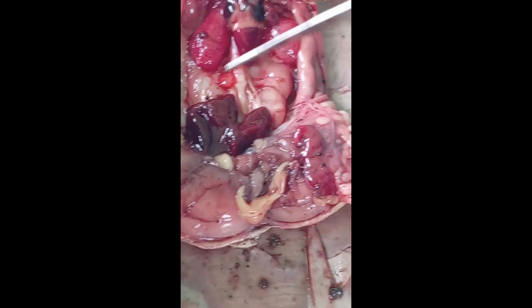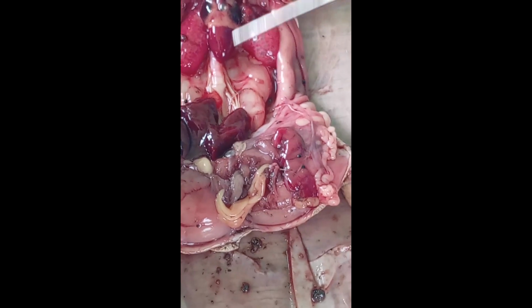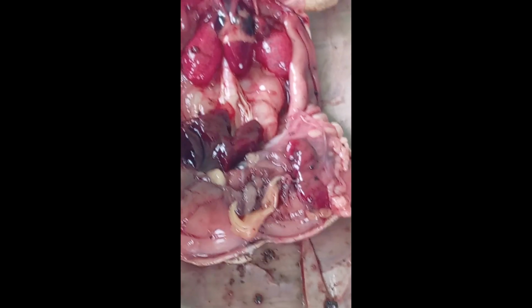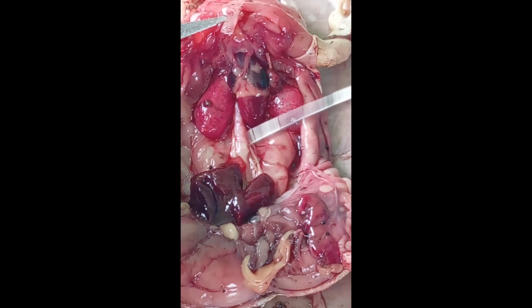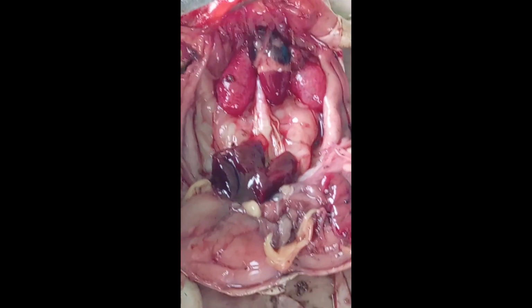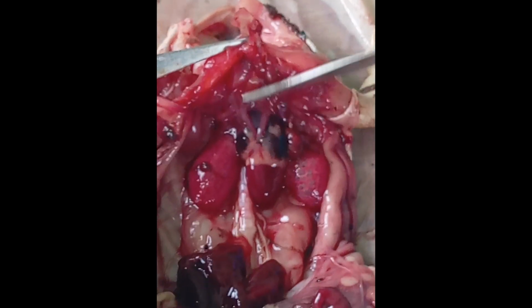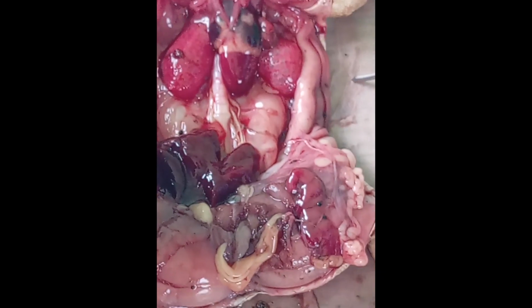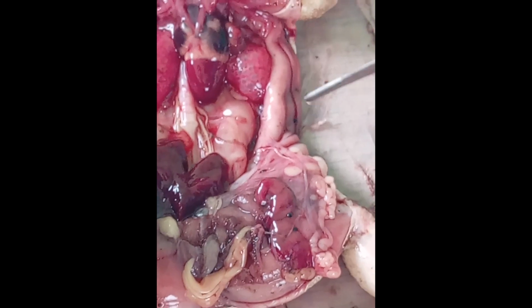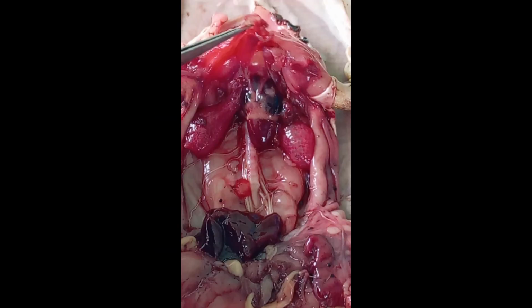And then you see the abdominopelvic structures are also down here, but the heart and the lungs are in this area. So you can see they are in a specific area. They can't be mixed up. So the heart with its lungs in the specific region have their specific cavity, even if they are not separated by any diaphragm from the abdominopelvic region.